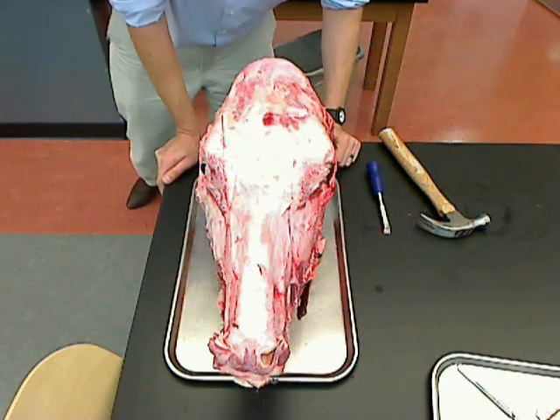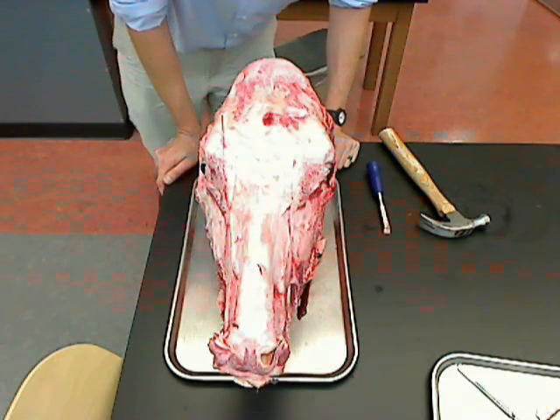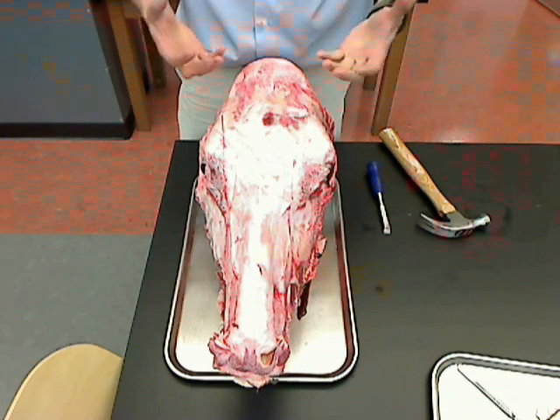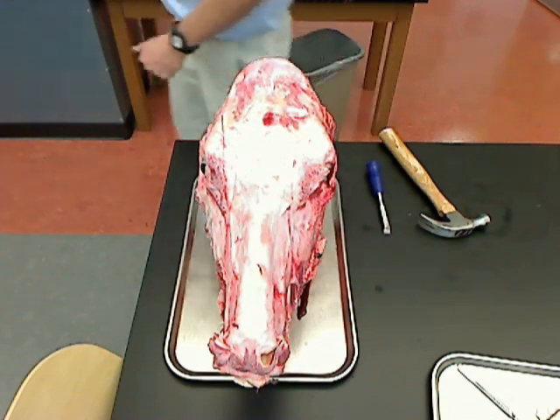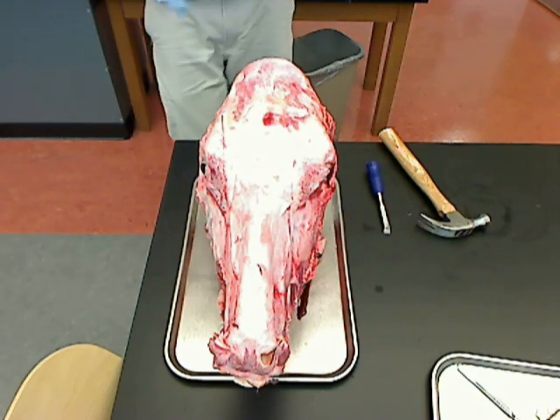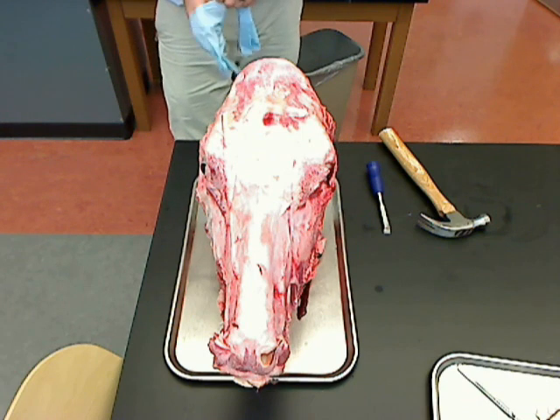Welcome to Glenelg Community College Anatomy. This is Dr. Ren Hartung and we're going to dissect this cow's head to take the brain out if we can. We're going to try to do it in a hurry to give an exam on it — about 40 minutes.